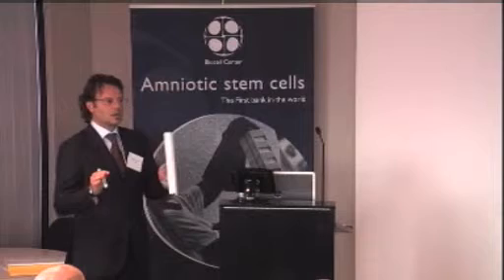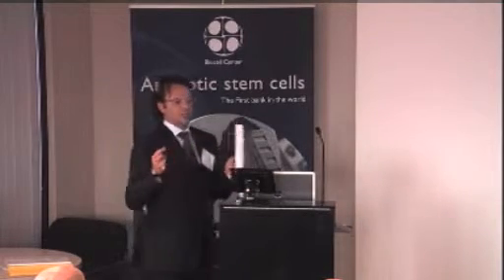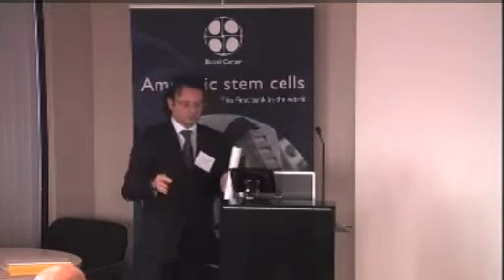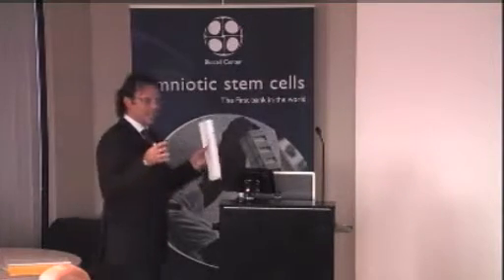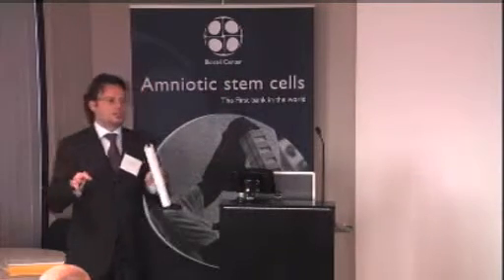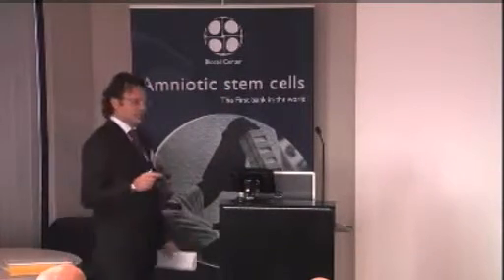That means that the isolator provides a high level of sterility assurance, preventing contamination from the outside getting inside, and also containing any contamination that occurs inside the isolator, preserving the operators and the environment.